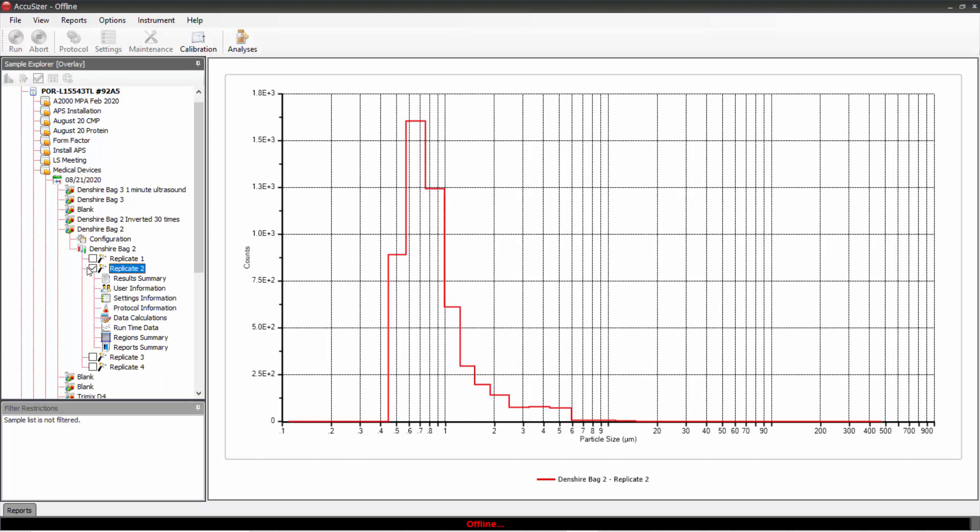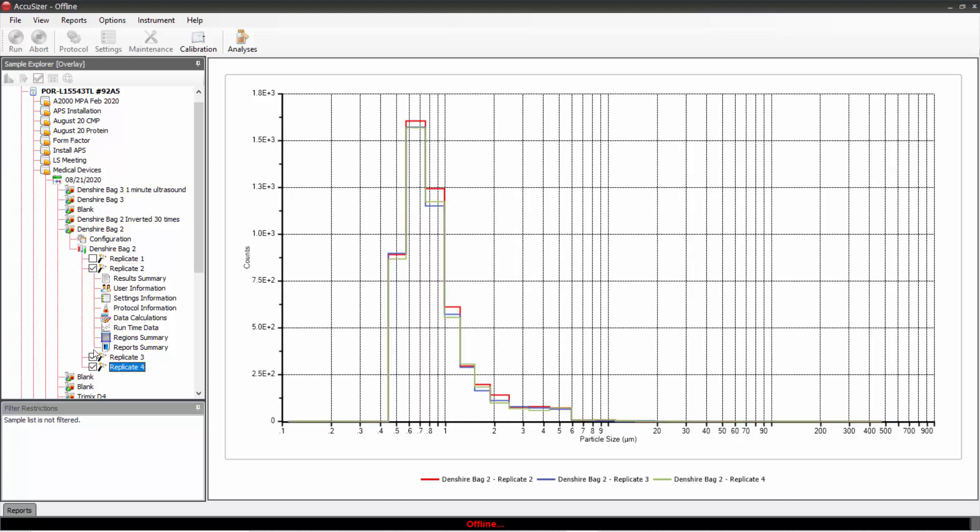Now you see these boxes over here in the sample explorer. If I click also on replicates three and four, I now have chosen replicates two, three, and four.